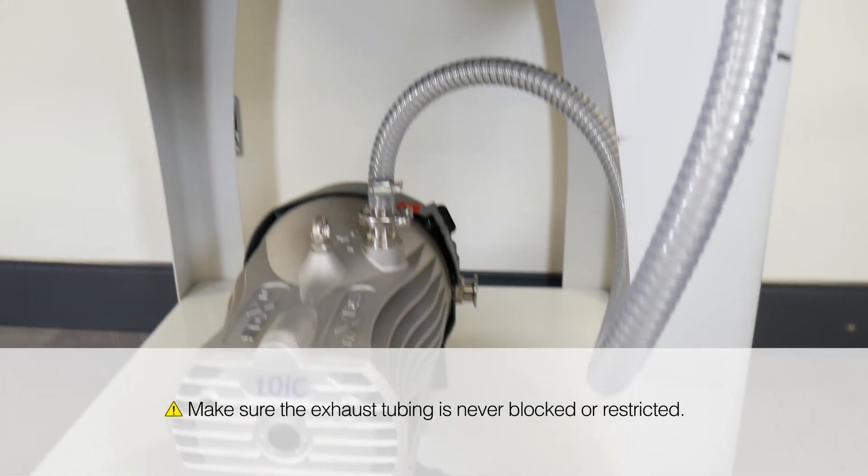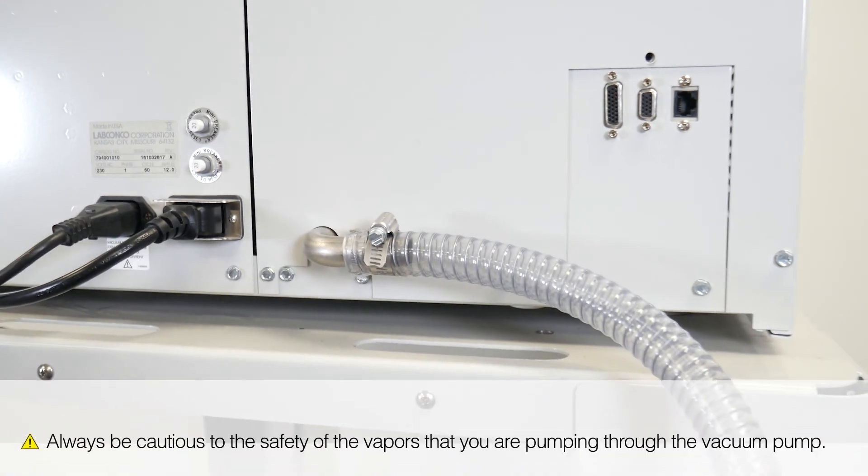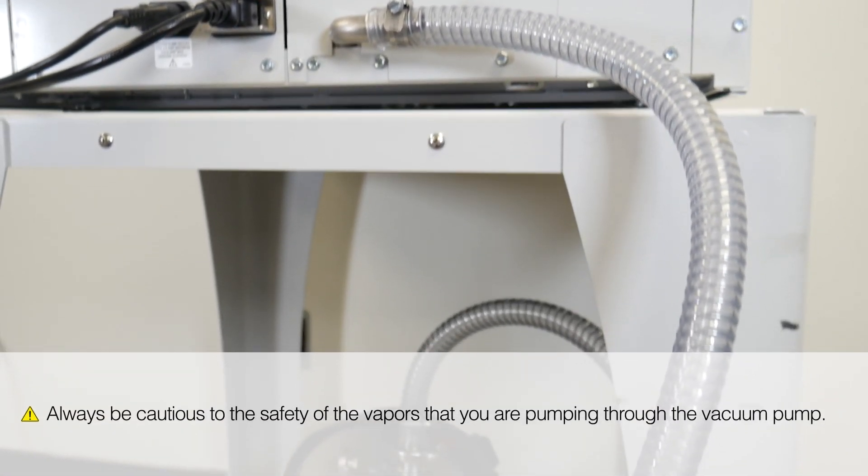Make sure the exhaust tubing is never blocked or restricted. Always be cautious about the safety of the vapors you're pumping through the vacuum pump. If the vapors are hazardous, the vacuum pump should be placed in a fume hood or the exhaust tubing should be vented to a fume hood.